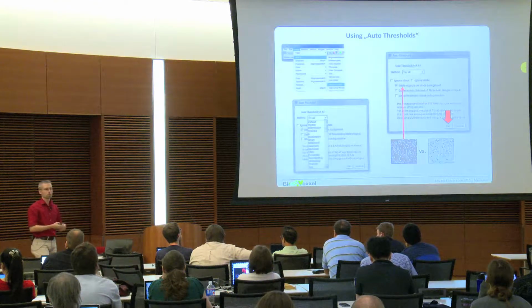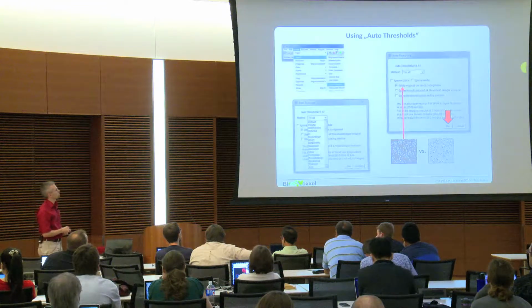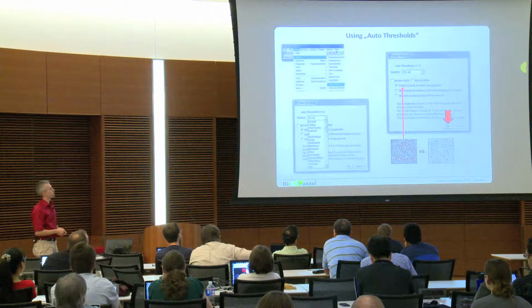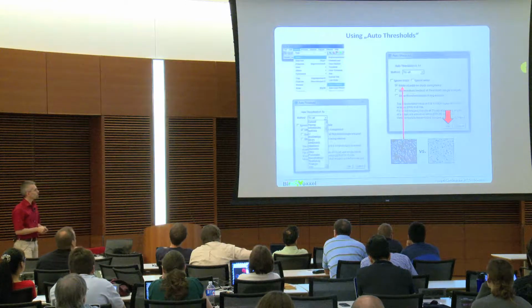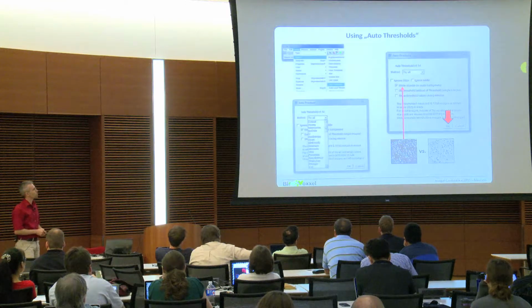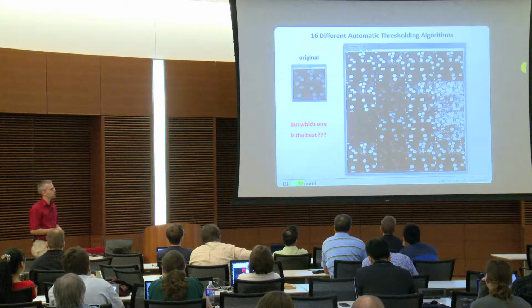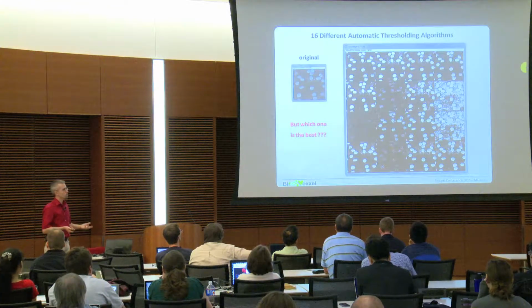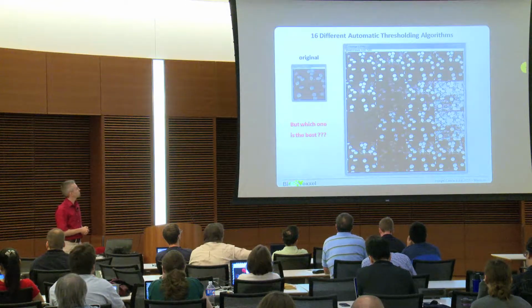And if you have a lot of them, that makes a difference for some thresholds. So it's an additional option. In the beginning, I would first try it without that. So if you apply that with try all active, then the outcome looks like that. You get a montage with the 16 different output images.